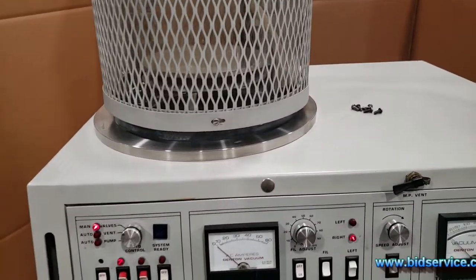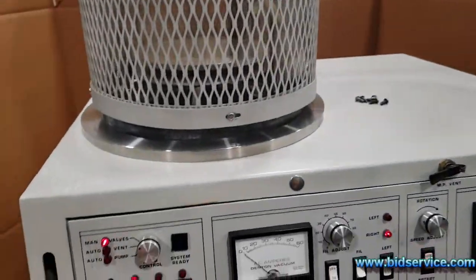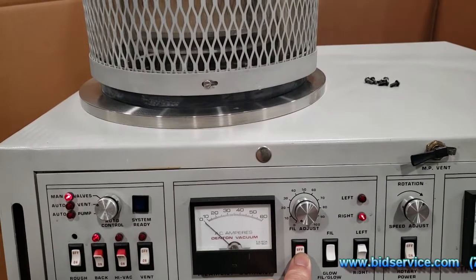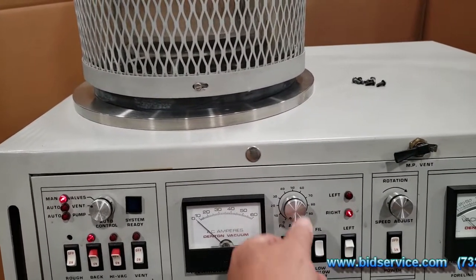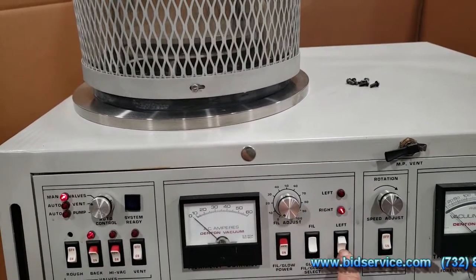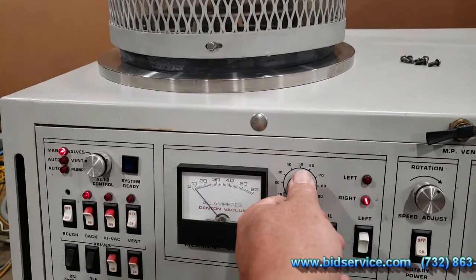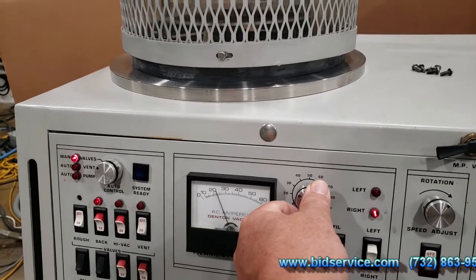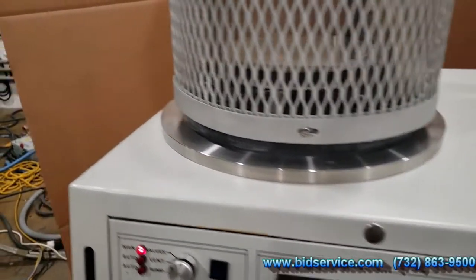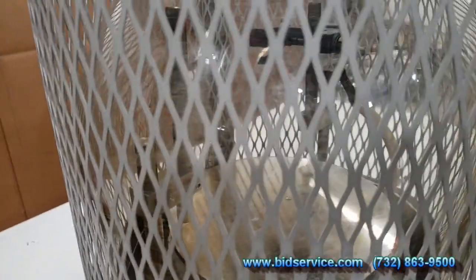What I'm going to first show you is that the system right now is under vacuum, and I'm going to turn on the filament. It's got a carbon source in there, so I'm going to turn the filament on. I'm going to make sure it's on the right-hand side. Now I'm going to increase - you're going to see this gauge go up, and that means the carbon rod is going to start glowing.